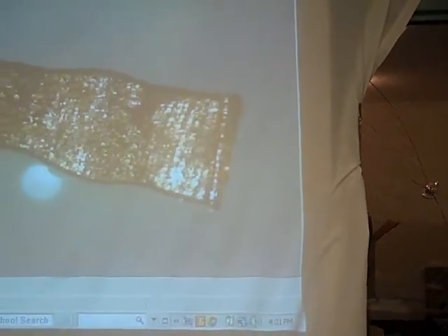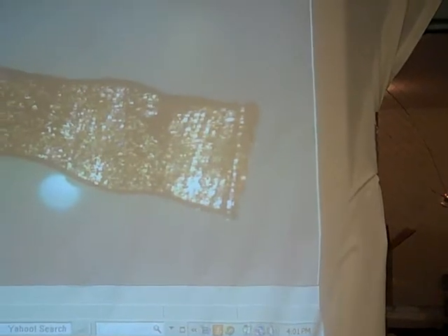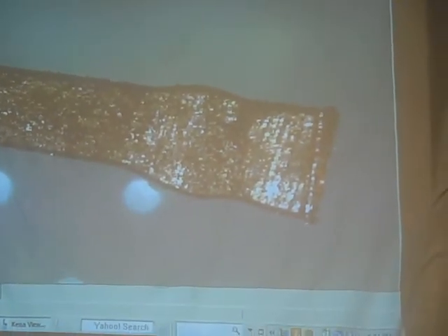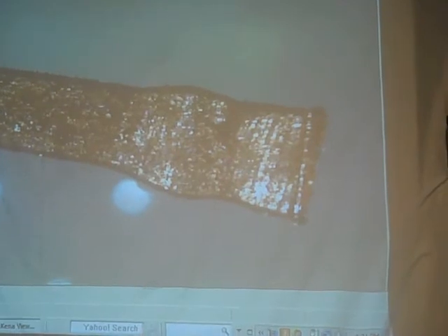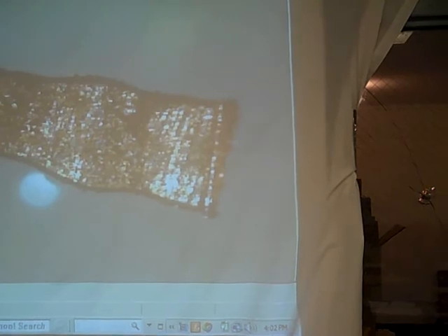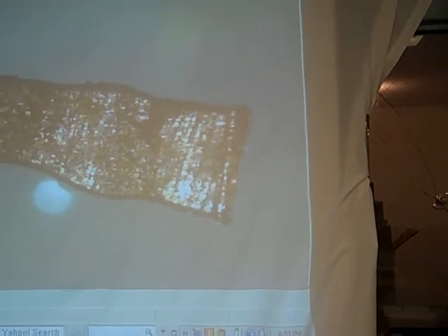Now, notice around the rest of the edge there? Notice how it's starting to look fuzzy? We're just going to sit back and watch the fuzz for a bit. Because it starts on the right edge — and look at that right edge top corner. Boy, is that beautiful. So we're just going to sit back and watch that for a bit.